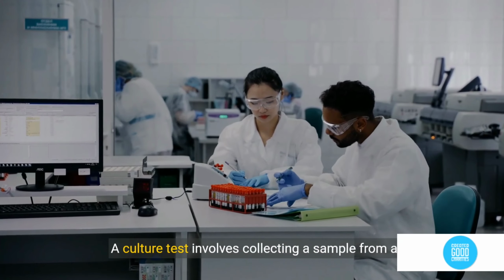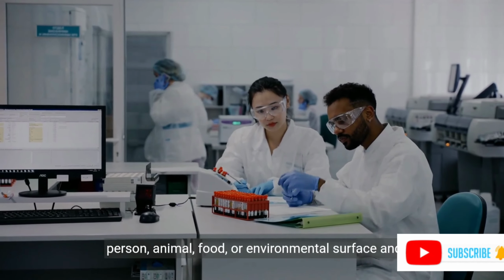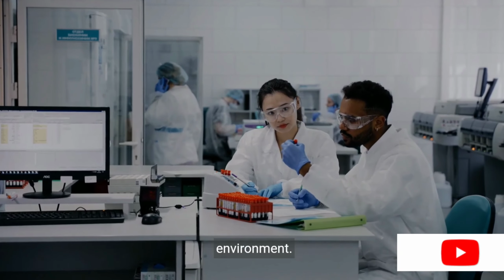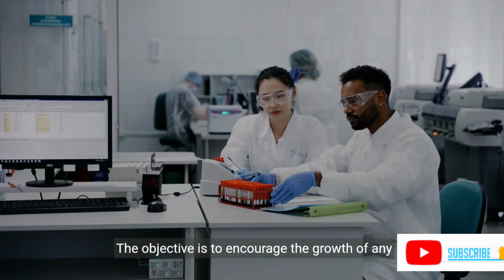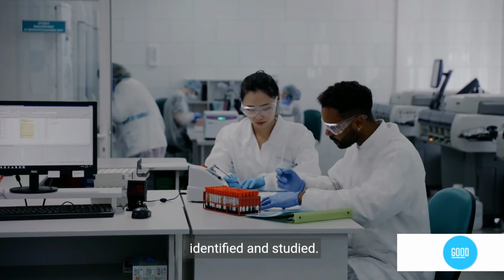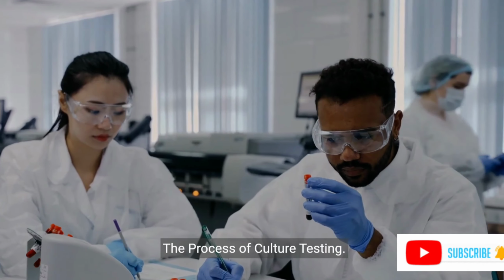A culture test involves collecting a sample from a person, animal, food, or environmental surface and cultivating it in a controlled laboratory environment. The objective is to encourage the growth of any microorganisms present in the sample so they can be identified and studied. The process of culture testing.